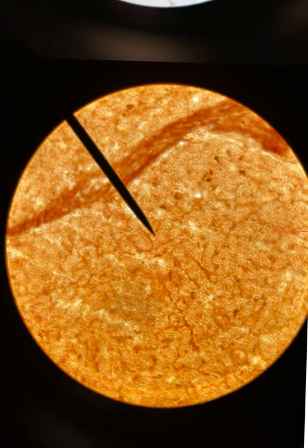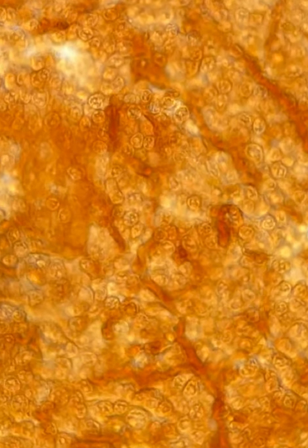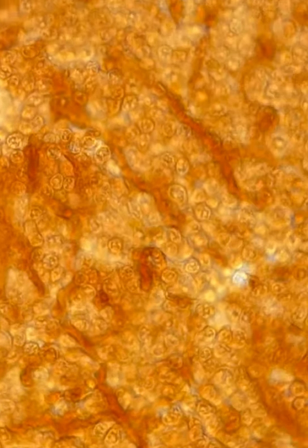And then here we have reticular connective tissue. Reticular connective tissue functions to support tissues and immune cells. So if you look here, they sort of look like grapes. So you have like the vines, and then you have these little tiny grape buds. This is specific to reticular tissue, and you can really see it up close.